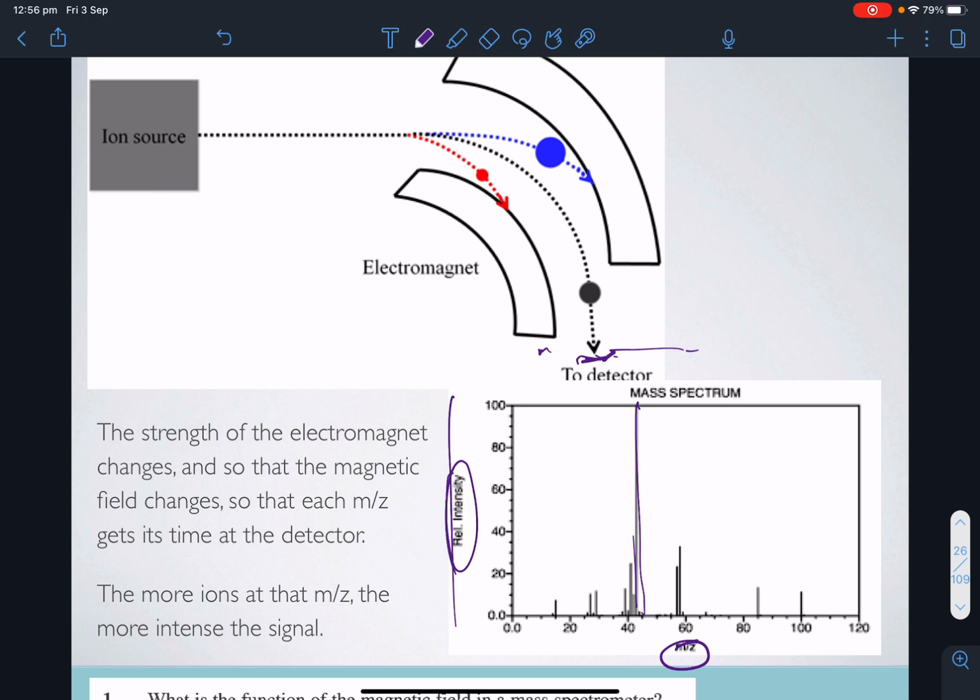See how you've got different relative intensities. Okay, you can see one's really big and you can see others are really small. What ends up happening is the machine automatically detects the most abundant and sets that to 100%, and then scales the intensity of every other fragment mass that it detects according to that. So the maximum for these will be 100, and this one we call the base peak. Okay, and all that is the most stable fragment that comes from the molecule that broke apart.